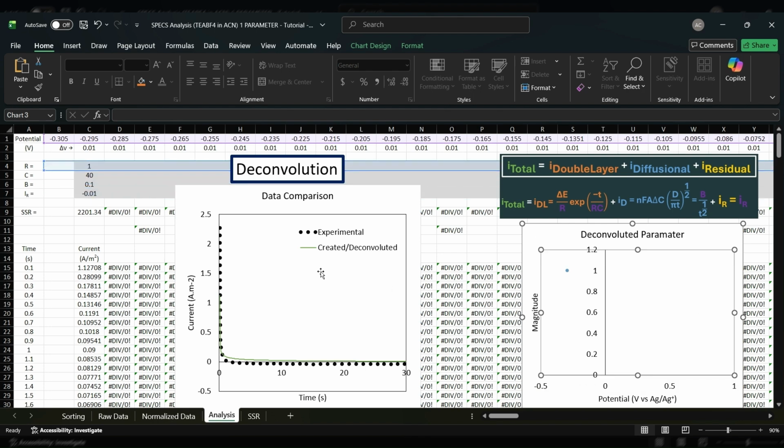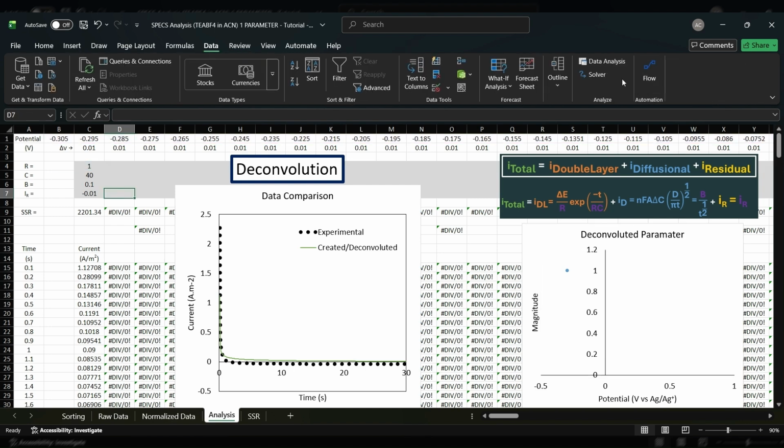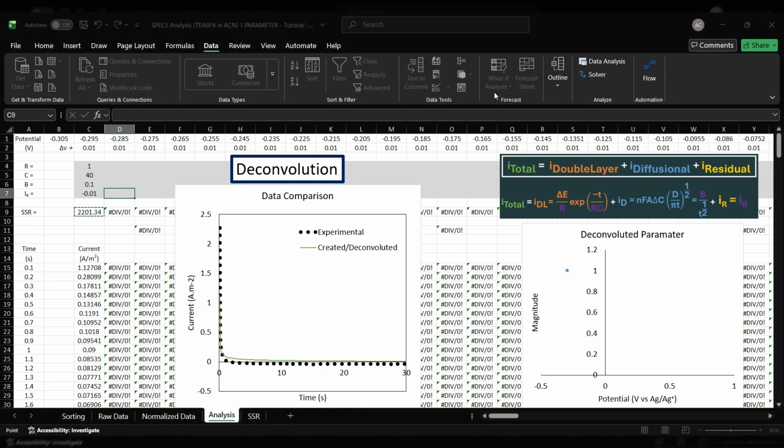So for Excel, I'm going to go to Solver, load that up, make sure this is clicked onto a minimum. The objective I want to change is our sum of square residuals because we want to make that as small as possible as we discussed. And I want it to change these variables here to be able to make this as small as possible. Make sure this is unticked and this is set to minimum. And then I'll ask it to solve.